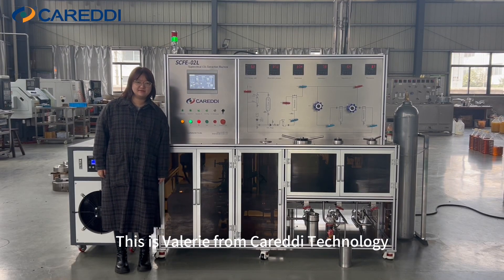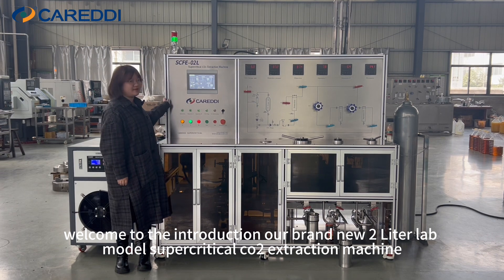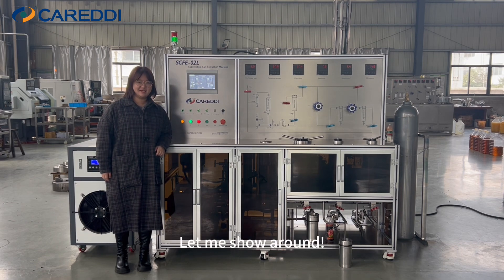Hi everyone, this is Valerie from Karady Technology. Welcome to the introduction of our brand new 2-liter lab model supercritical CO2 extraction machine. Let me show you around.